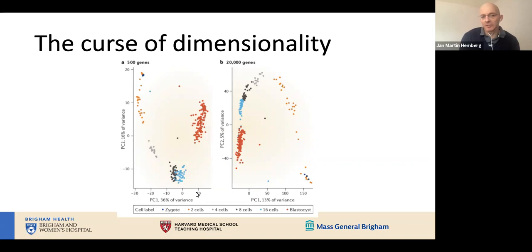You can also see this quantitatively, in that the fraction of variance explained by the different principal components is higher here. So this reduction of the number of features has allowed us to better pick out the biologically meaningful structure in this data set. This is a very useful strategy for dealing with this problem of the curse of dimensionality.